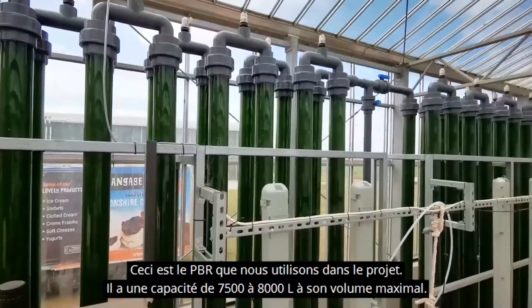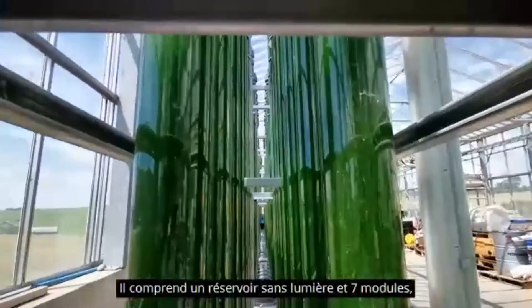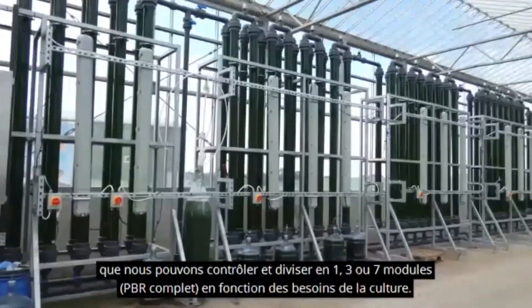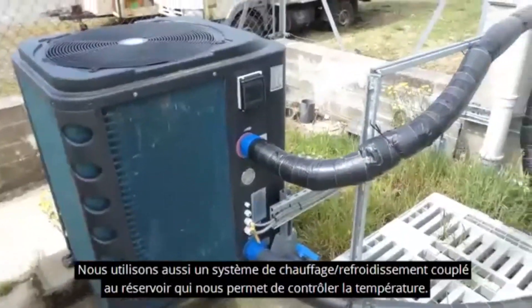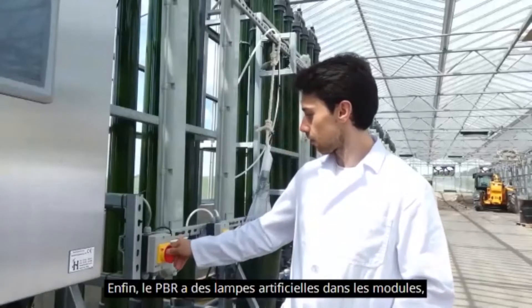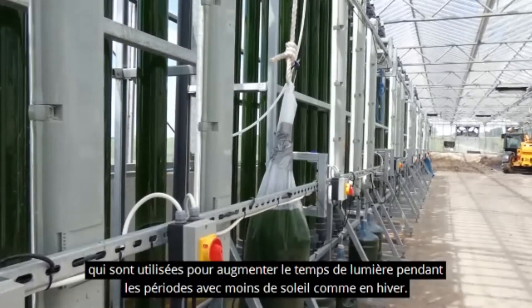This is the PBR we use in the project. It has a capacity of 7500 liters to 8000 liters at its maximum volume. It consists of a dark tank and seven modules, which we can control and divide into one, three, or seven modules — that is considered full PBR — depending on the needs of the culture. We also have a heating-cooling system coupled with the tank to control the temperature of the culture. Finally, the PBR has artificial light installed in the modules, which is used to increase the hours of light at times of the year when there is less sunlight, such as winter.